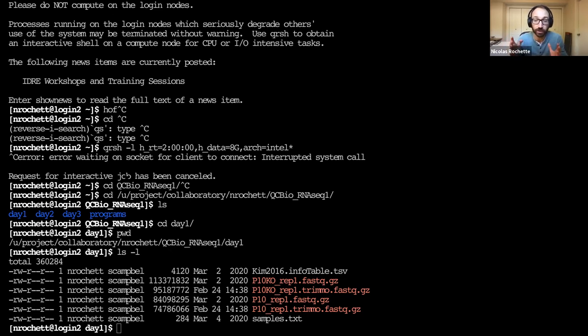You can do this for every 25 base pair sequence in the genome. If you've done this and you arrive with a read, you can just take the first 25 base pairs and ask where in the genome this read could come from. And that's very fast. That's the basic idea behind all the aligners. It's trying to reverse the problem: not having to try all the different positions in the genome, but instead arriving with a sequence and already having the information of where that sequence may go in the genome. Cool.